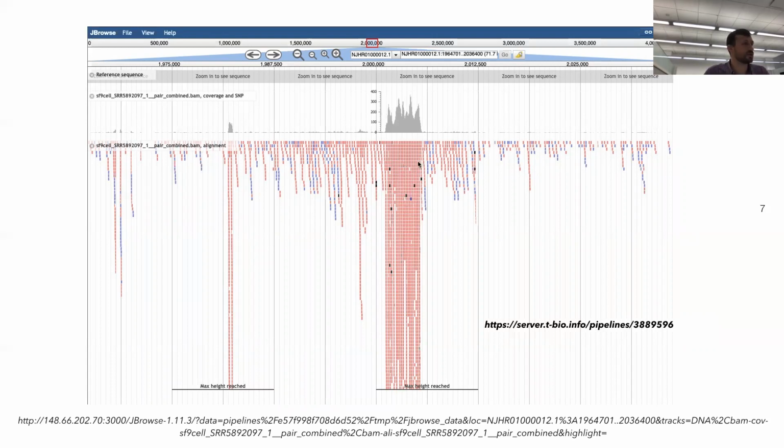You can see that there is an abundance, and you can see also the types of reads. So the blue and red ones are going to be those paired-end reads, so reads that go one direction or the other direction. And sometimes you will see these black ones, and the black ones are going to be the ones that don't have a matching pair.